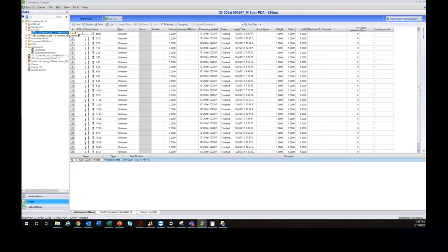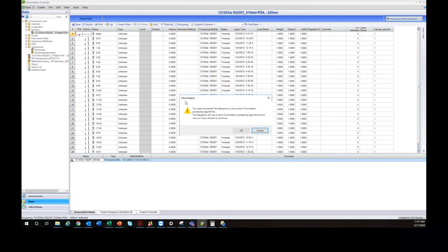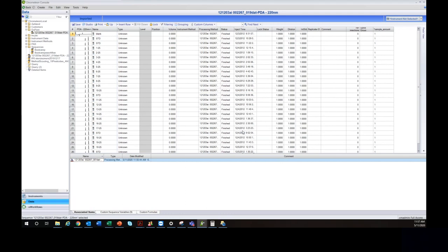Now that the data has been imported, we want to convert it so we can process it using the Chromeleon algorithms. Before doing anything in the studio, click Convert. We'll be able to process the data using Chromeleon algorithms if we continue — click OK. You can see the truck icon changed from blue to a tan color, indicating it's been imported and converted. We're now ready to start processing the data.